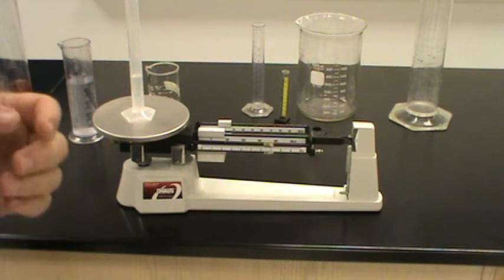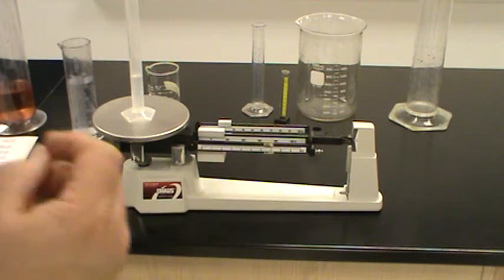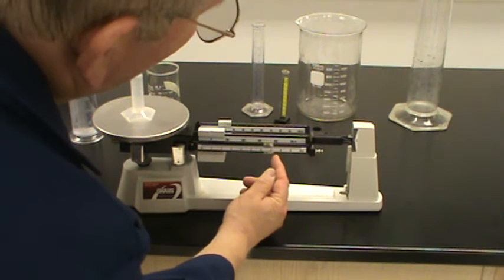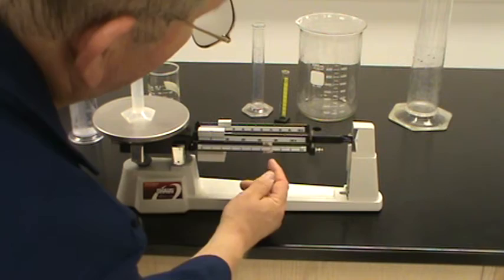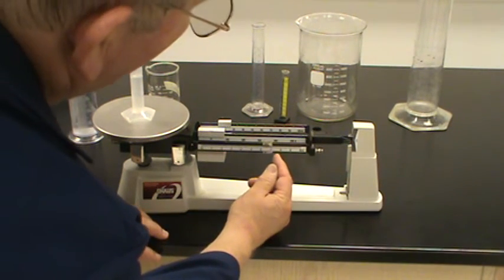All right, so I'm going to run the 10s over. 1. There's 20. I've let go. And. Ooh, in this case, it's still just a little heavy. So somewhere, either I don't have quite enough water in there, even though it looks like it's 10 grams, or something else went wrong. But let's move this back 0.1 gram. There we go. And not quite there. Come back.